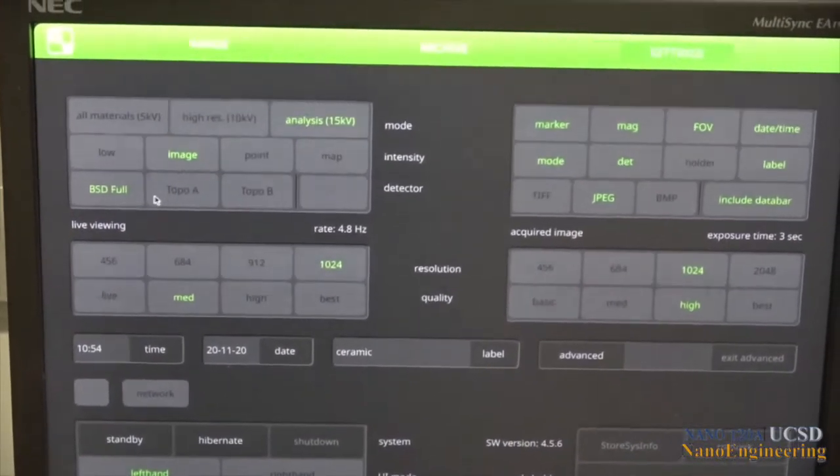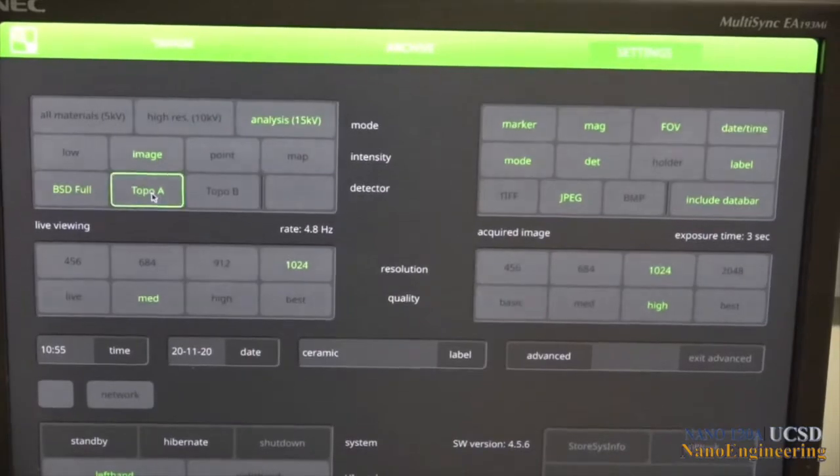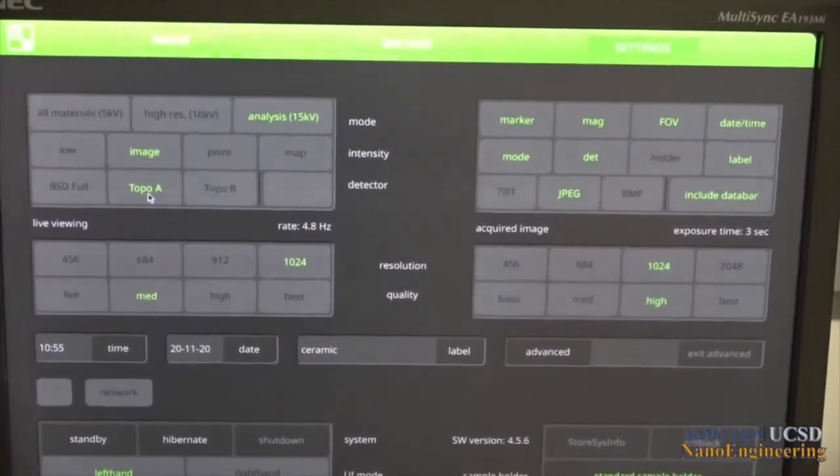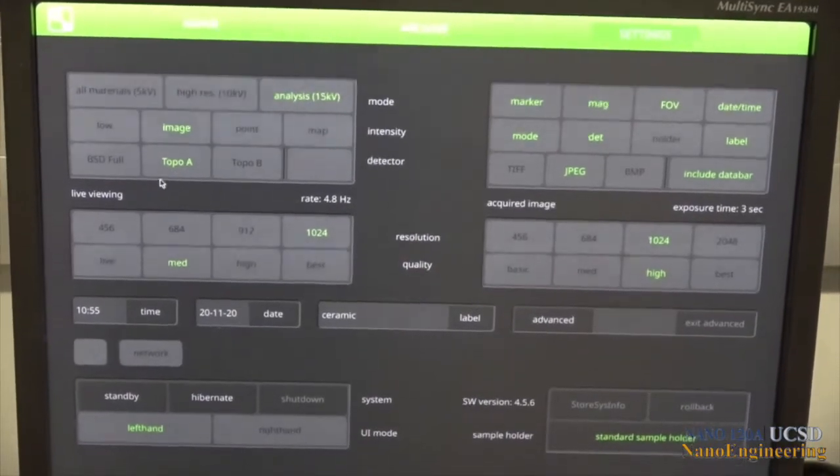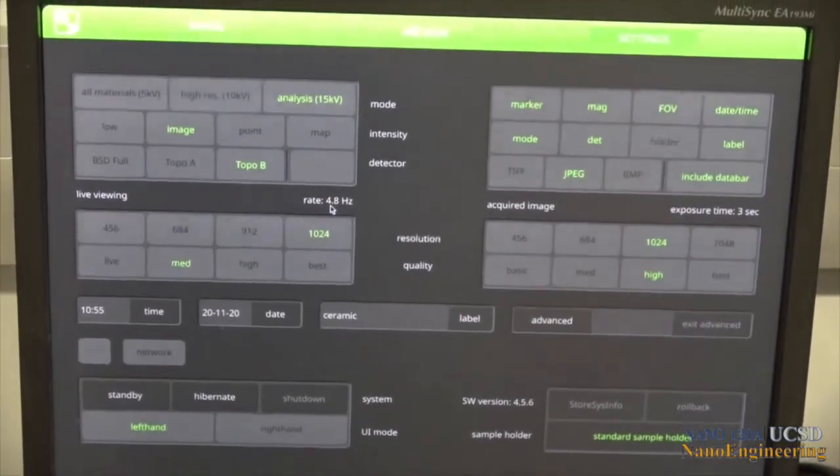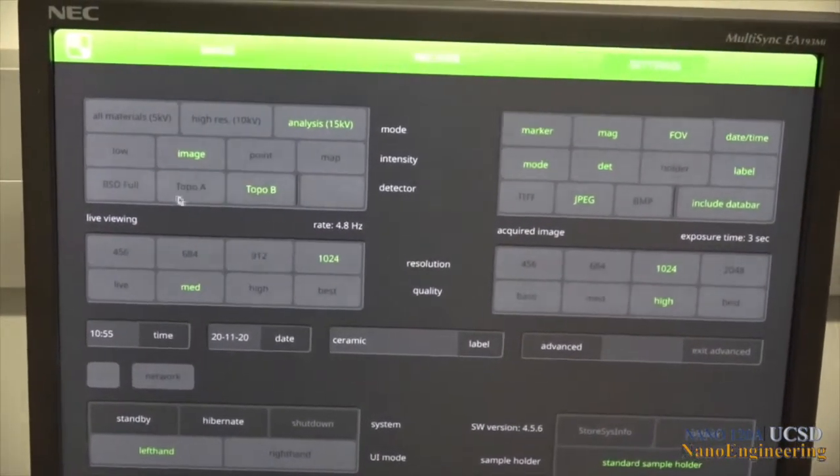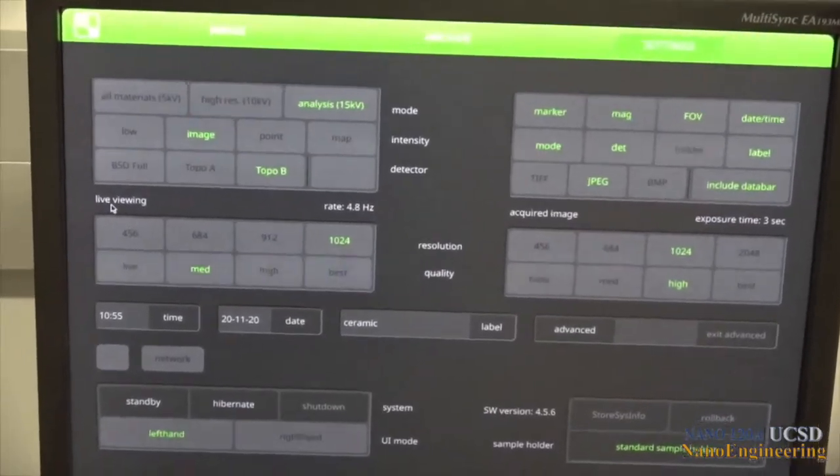The detectors menu allows us to choose the mode of operation for our backscatter electron detector. BSD full has all segments on and provides good atomic number contrast. The topo A and topo B modes turn various segments of the detector on or off to provide topographic contrast.